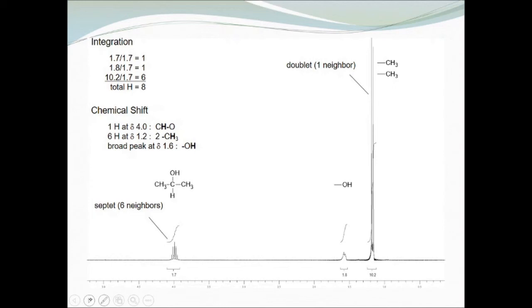Now, when you are discussing the NMR, you will need to include an interpretation in your discussion section. In addition to explaining what the splitting and chemical shifts mean and how you're deducing your structure, you do need to make specific assignments, assign particular hydrogens to particular peaks. And so for that, we need to label our hydrogens. And so we will go through HA. So this peak is a result of hydrogen A.